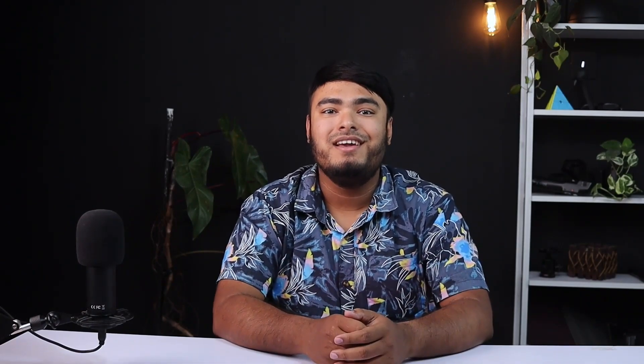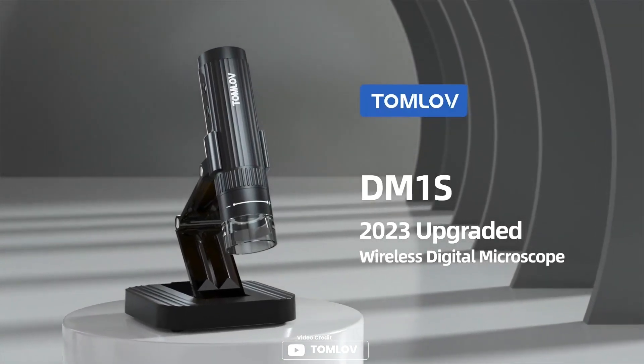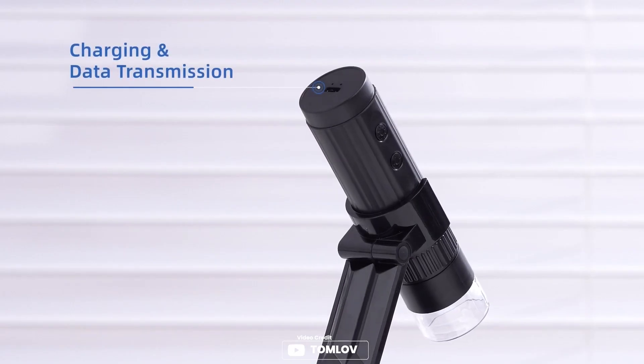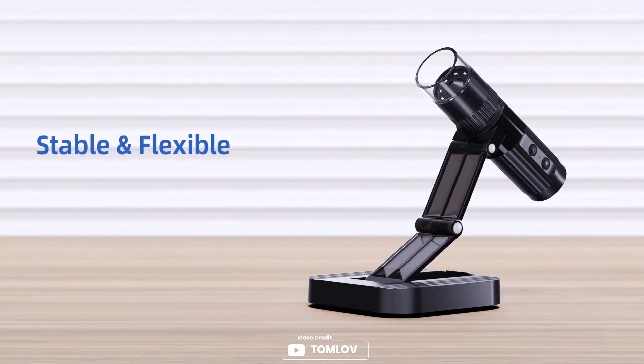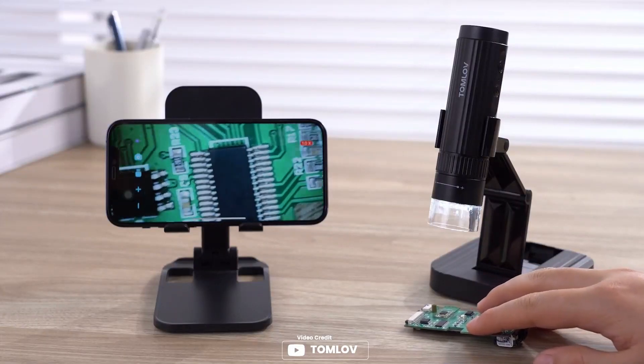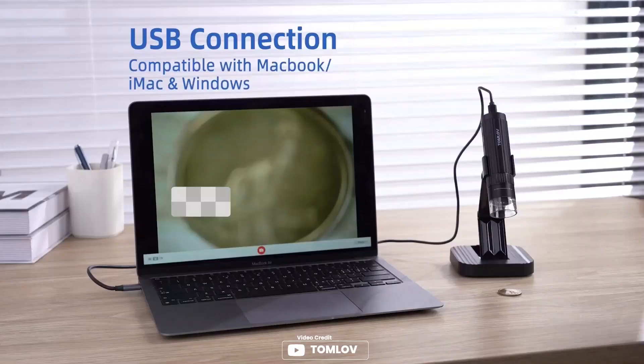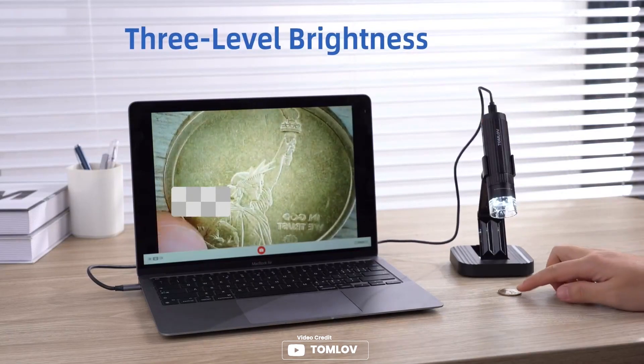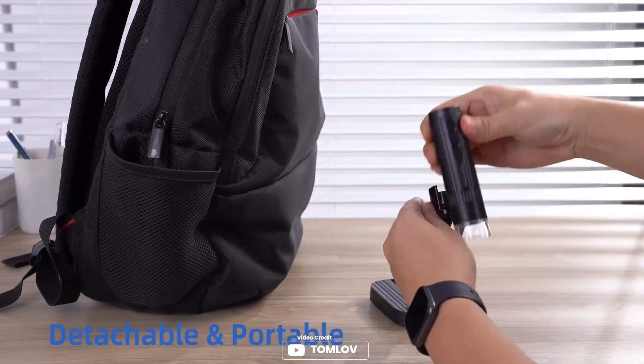Introducing the TAMLOVE DM1S Wireless Digital Microscope — a meaningful tool for collectors, teachers, students, parents, and children. With 1080p HD and 8 adjustable LED lights, the microscope delivers incredible details of observation in full lightened view. Its Wi-Fi and USB features make it easy to use, as it can connect to your iPhone, iPad, Android phones, and tablets by Wi-Fi, and connects to your computer for a larger view by USB cable. The microscope also has a feature that lets you take photos or videos of what you're observing with one click and save them to your phone. The DM1S is also equipped with a USB port for connecting to Windows and macOS computers.